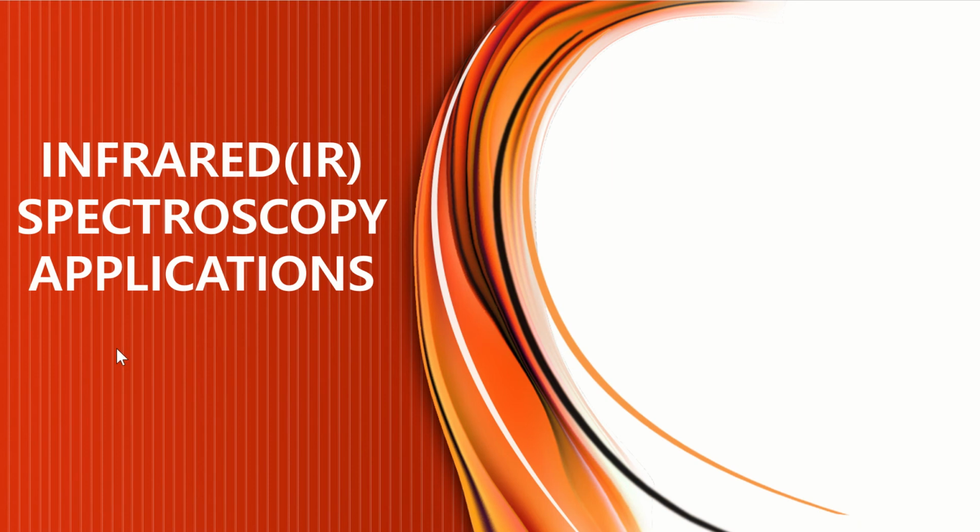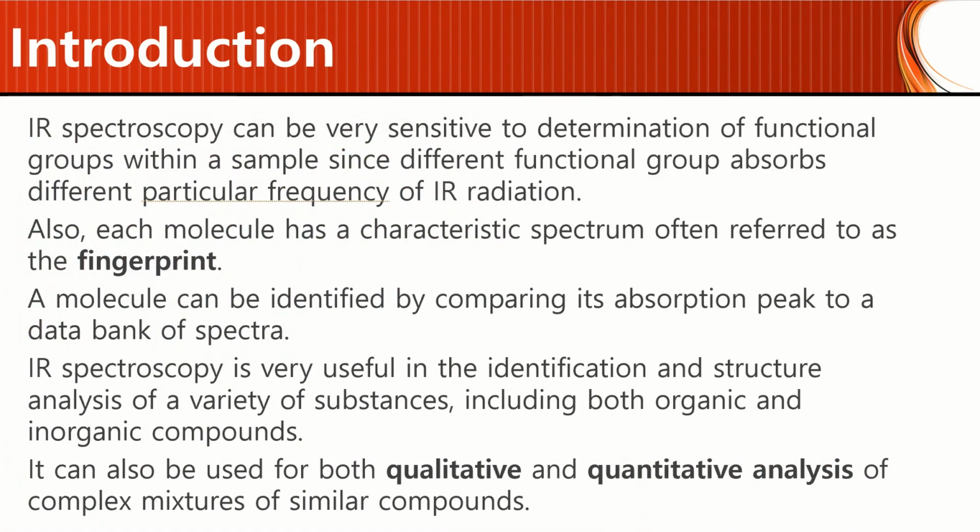So now we're going to talk about IR spectroscopy applications. All right, so let's see if we can, at some point, go into some applications. We're going to mention a little bit more about how we use it.